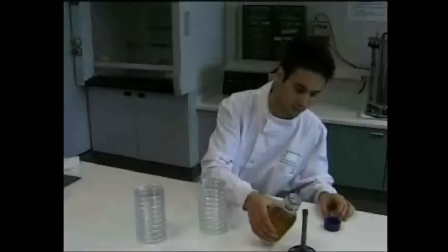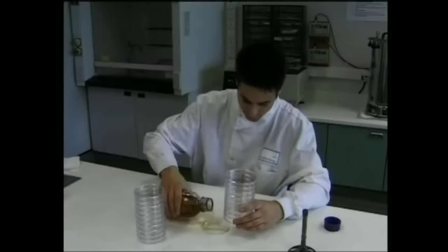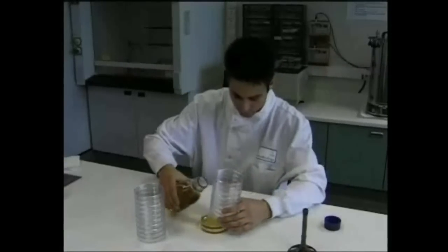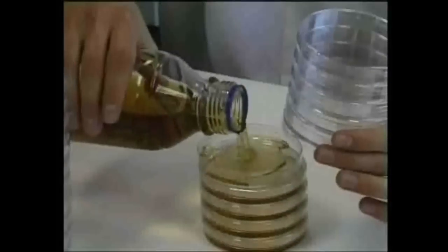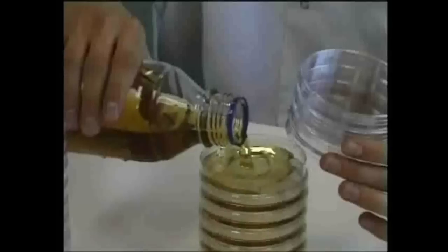Solid media, however, contain agar as a solidifying agent. Agar is obtained from a type of seaweed and has no nutritional value, but it does have unique properties as a solidifying agent, because it melts at 100 degrees Celsius and it sets at 40 degrees Celsius. It can be maintained at a molten state in a 50 degrees Celsius water bath.